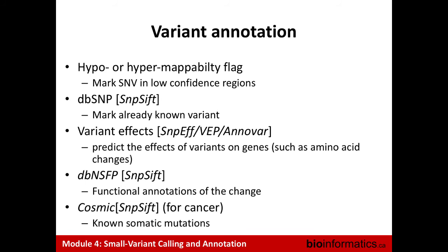What's your cutoff for saying that this is a variant? Let's say you have 100 reads covering a base, and only 10 of them have a variant. Would you call it a variant after all the filtering? In germline, it would probably not. If I have like 10% of my reads, it would need really, really good quality and perfect matching, otherwise it will probably be discarded as a possible false positive.